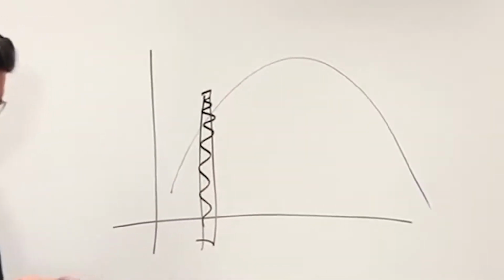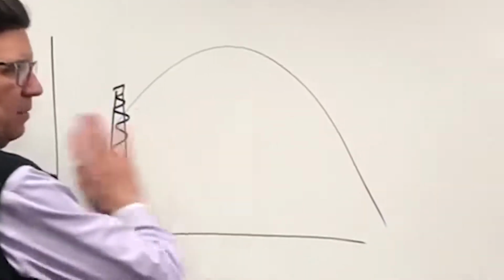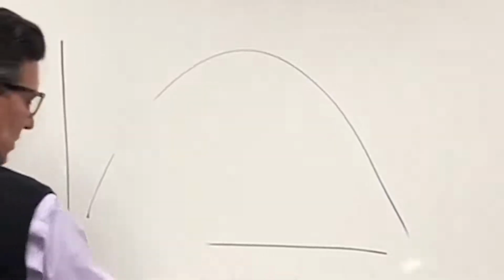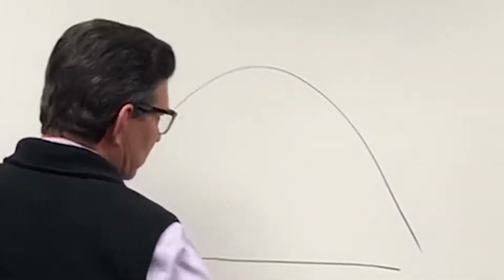That's what I get from my sample. It tells me a lot about what was in the line at that particular point in time, but it doesn't tell me anything about what's happening out here. Right? So not a bad deal, it's not ideal, and it doesn't give me all the information that I need.